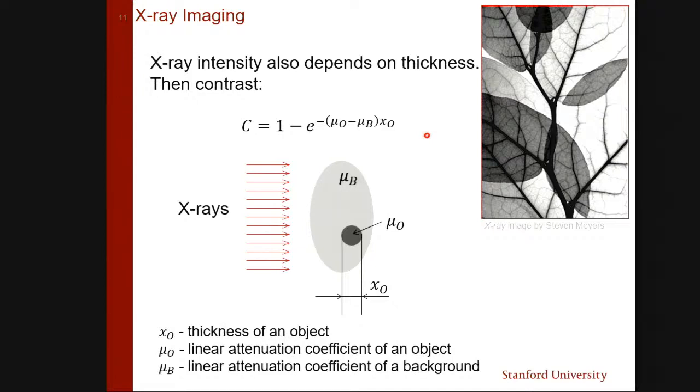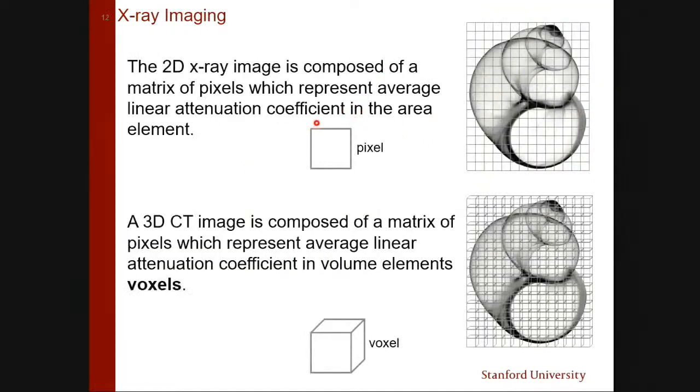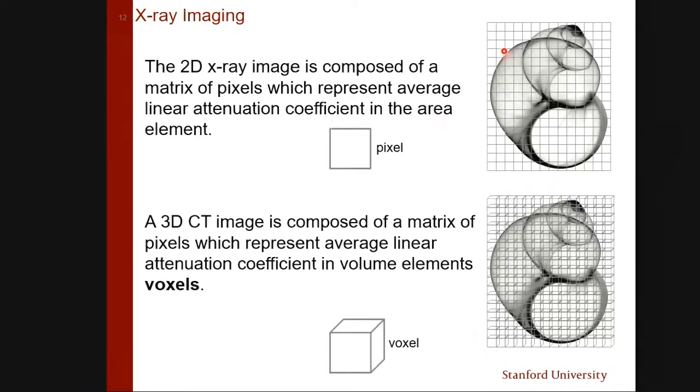Everybody probably has a phone or camera or something, and you know each camera is characterized by the number of pixels, right? So the more pixels you get, 12 million pixels is a good camera, maybe 10,000 pixels is a bad camera. The same is related in tomography, because we have a detector which, of course, has pixels. And a pixel, you know, is a two-dimensional object. And when you take a photograph, you have that already, the image consists of these pixels right here.